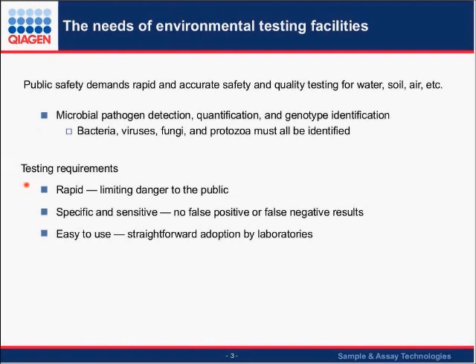Again, the testing has to be rapid so that we have limited danger to the public. It needs to be specific and sensitive, again with no false positives or false negatives, and again easy to use so that it can undergo straightforward adoption by laboratories.